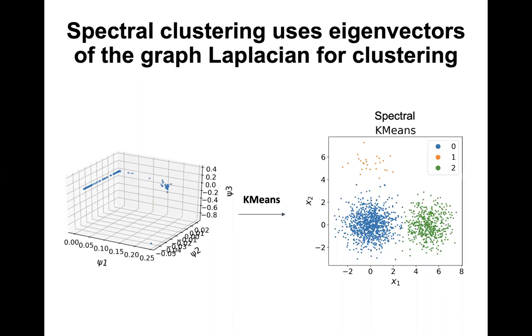And we can look at that shown on the original data axis to see now that spectral clustering, I'm just saying spectral K-means, but this is usually called spectral clustering, does a better job of handling one of those cases we were talking about earlier, where you have an uneven number of points per cluster. And so actually, we tend to use spectral clustering first when we're looking at a new data set and we want to identify new cluster components.